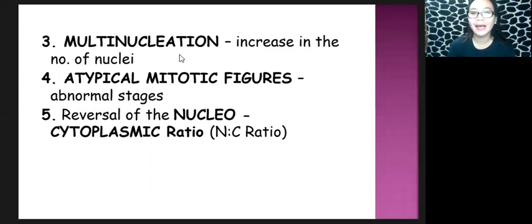Normally, your nucleocytoplasmic ratio should decrease because the proportion of your nucleus in reference to your cell size decreases. In contrast, the proportion of your cytoplasm in relation to your cell size increases. Thus, the nucleocytoplasmic ratio should be low when the cell is already mature or as the cell matures.